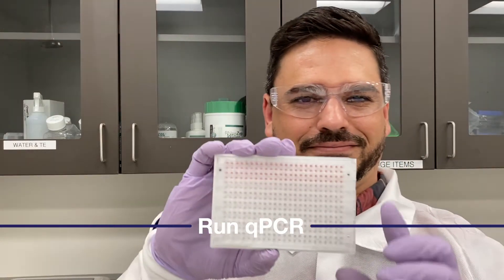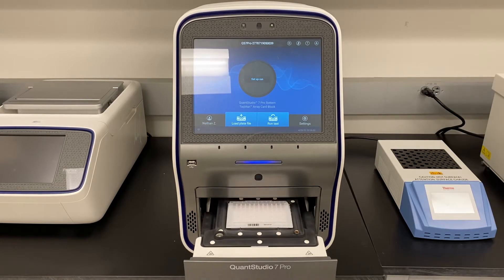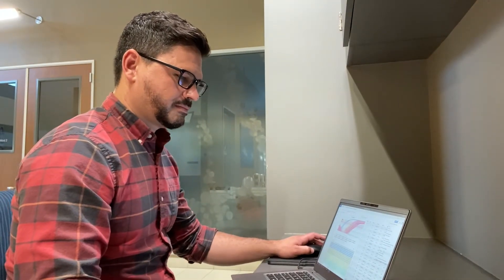We can run our card on any compatible Applied Biosystems real-time PCR instrument with the correct block. Let's start the run — it should be done in about 30 minutes.